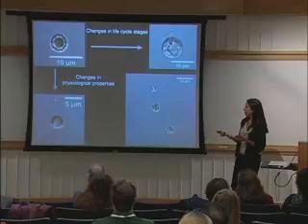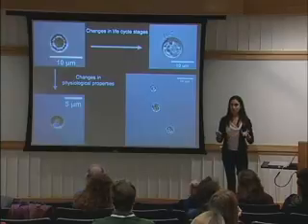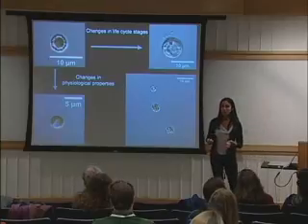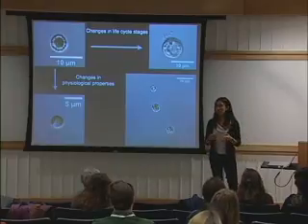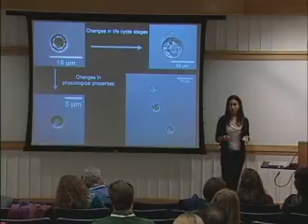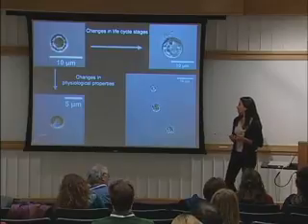And then sometimes in cultures we have cells that do not bear any plates. Some strains are famous for losing the ability to calcify, like strain 1516 of Emiliania huxleyi, which is the one that has been used for the genome. This strain is extremely temperamental. It stops calcifying, particularly if you grow it in high nutrient conditions, and sometimes it's not possible to make it calcify again. So it's very important to look at the cells under the microscope.